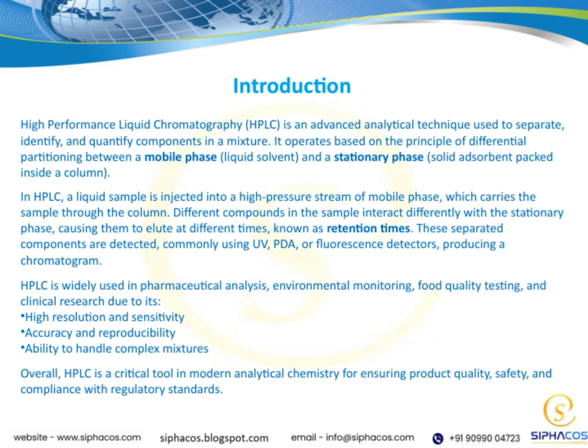HPLC is incredibly versatile and widely used across many fields: pharmaceutical analysis, environmental monitoring, food quality testing, and clinical research. Its popularity stems from its high resolution and sensitivity, meaning it can distinguish very similar compounds with precision. It also offers high accuracy and reproducibility, ensuring consistent results. Plus, it can handle complex mixtures that other techniques might struggle with.